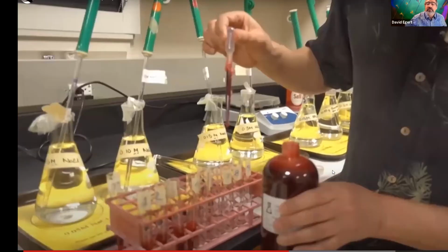I should also mention blood, once it's out of the body, starts clotting. We're going to see that in much more detail when we do the blood lab later. In order to make sure the blood stays liquid like this, you have to use some kind of anticoagulant. There's a whole bunch of different things like heparin that you add to keep the blood from clotting.